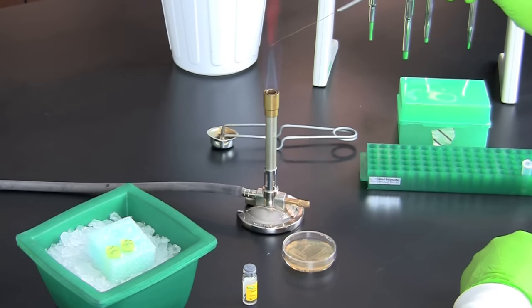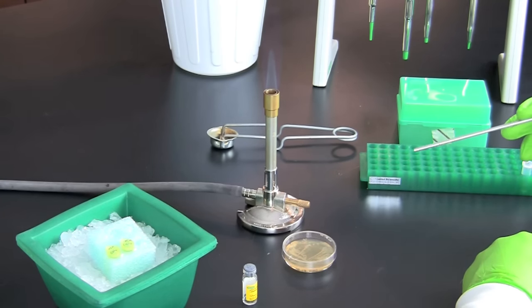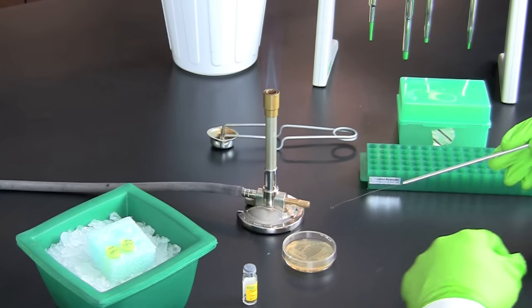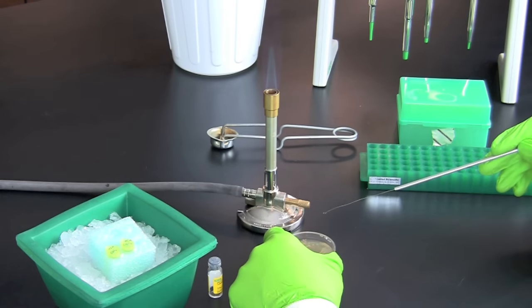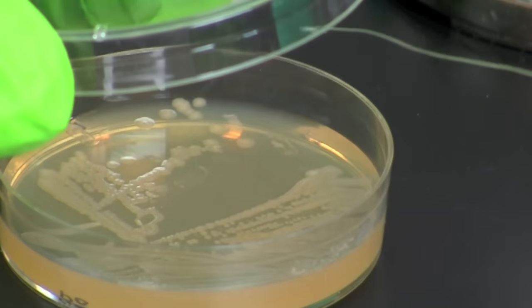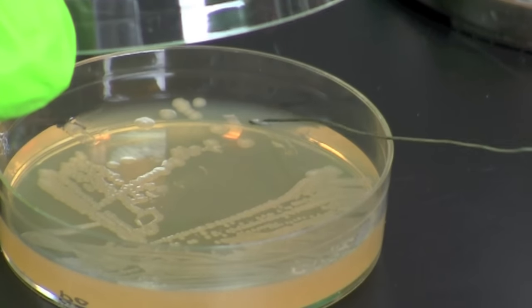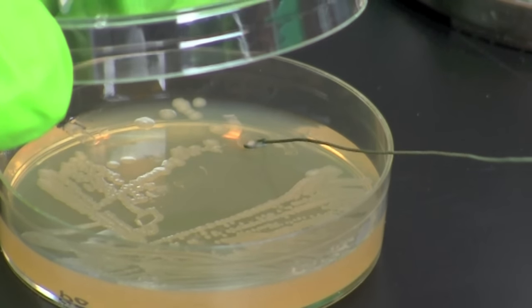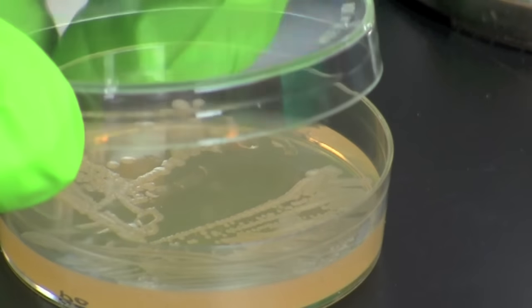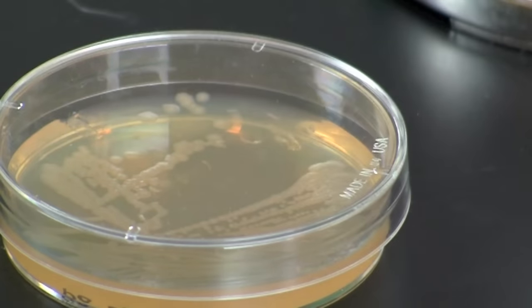Flame an inoculation loop and allow it to cool. You can lightly touch the loop on an empty spot on the starter plate to make certain the loop is cool. Then gently scrape one large or two small colonies from the surface of the starter plate so that they can collect on the loop.